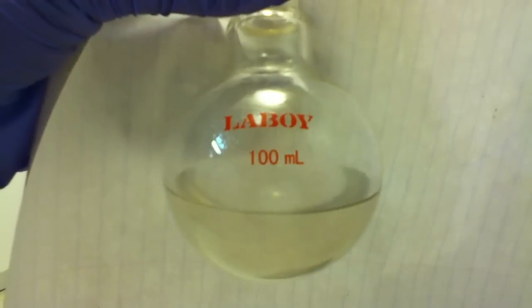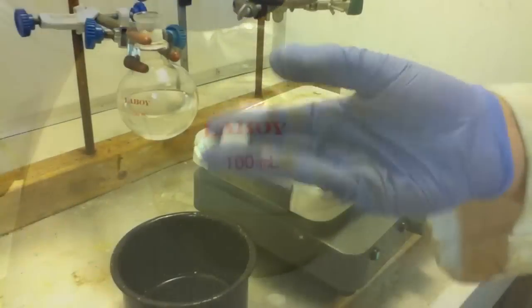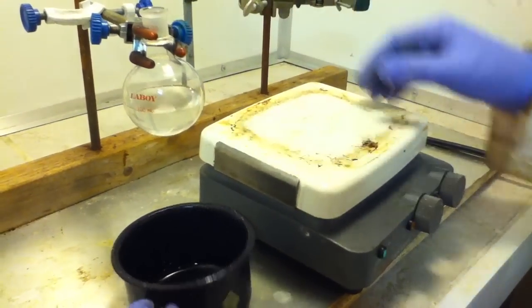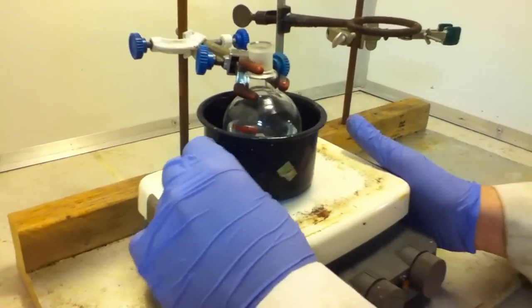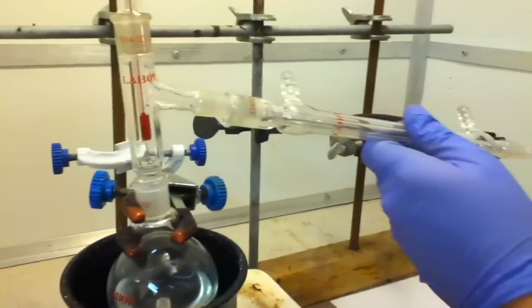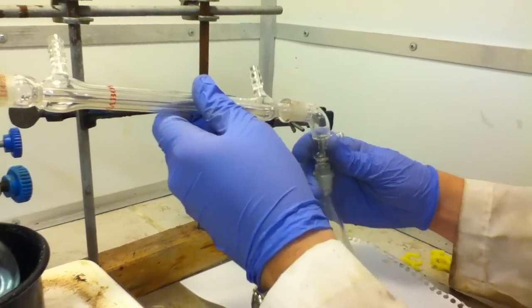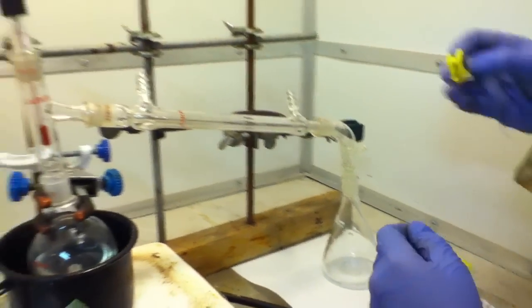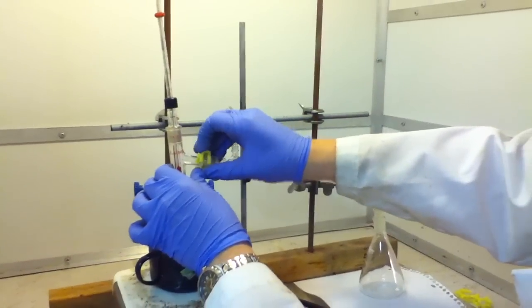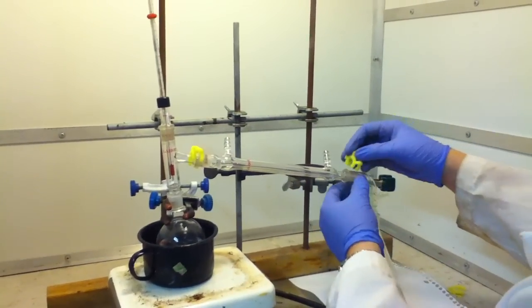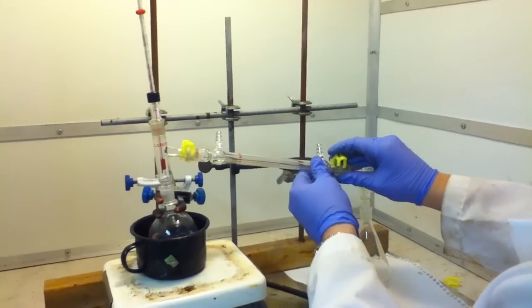This is the crude chloroform. Add a stir bar to the flask, immerse it in an oil bath, and place it above a magnetic stirrer and heater. Assemble an apparatus for downward distillation. Add keck clamps to the joints to make sure they are sealed. Use grease.